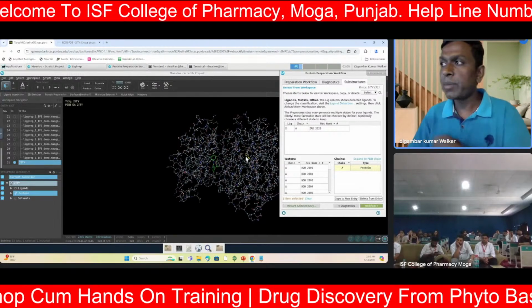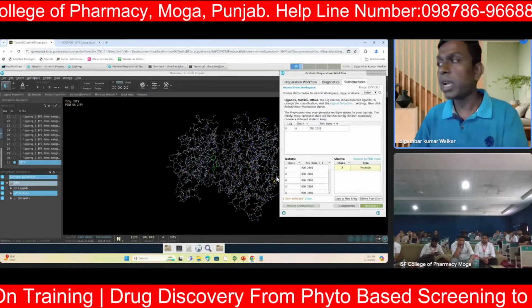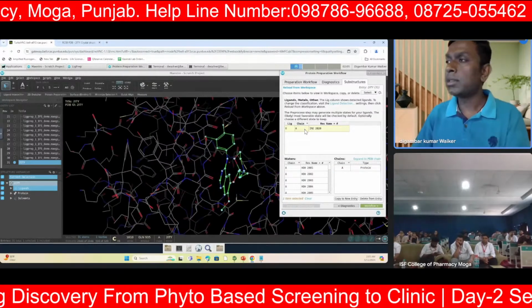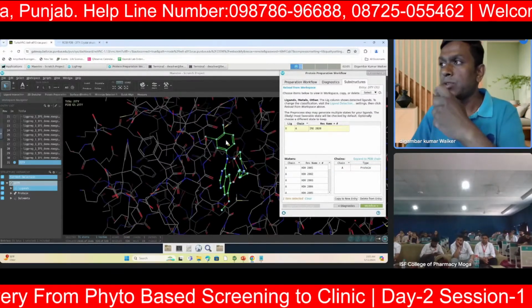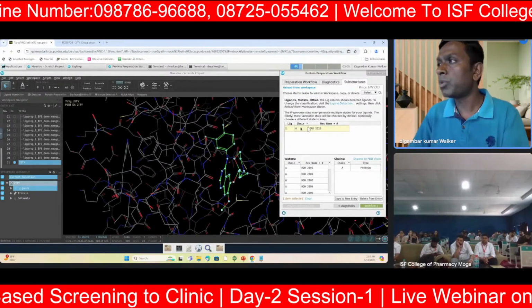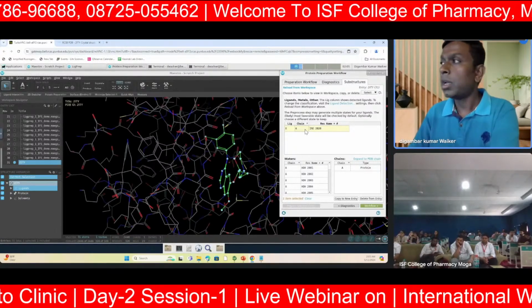The highlighted fragments indicate the protein backbone. If you want to see the ligand bound with that particular protein, you'll have to look at the ligand position. If it has just one ligand, it will show you just one ligand here.